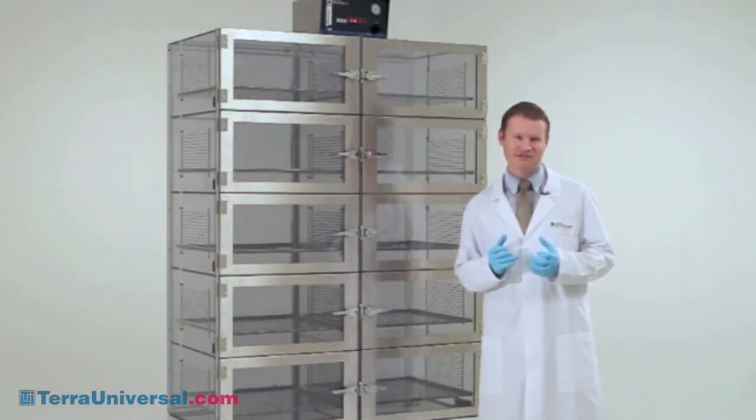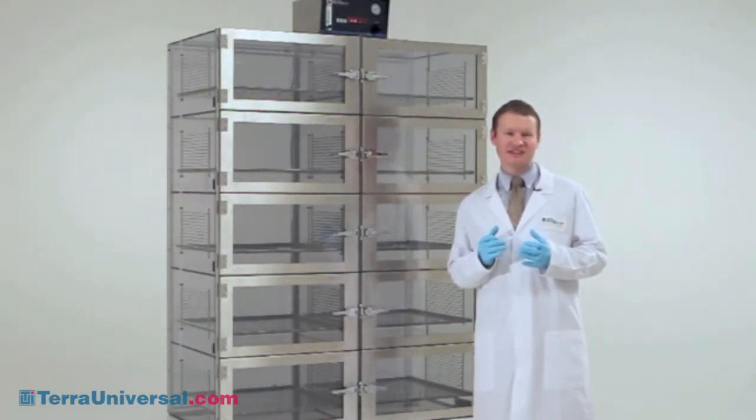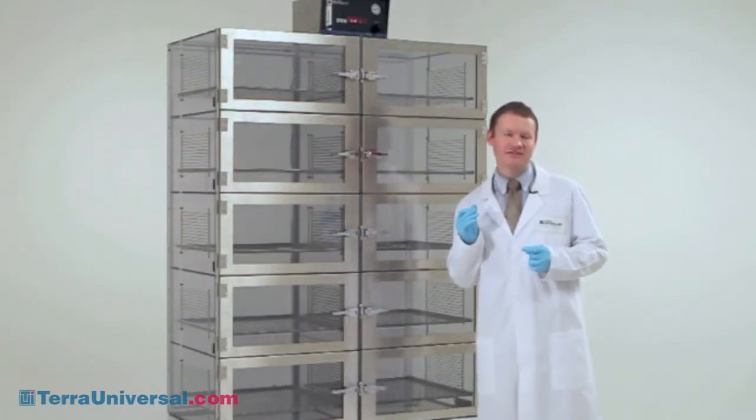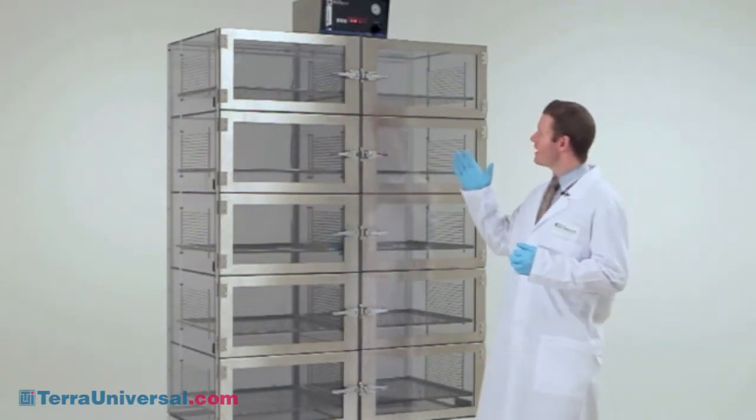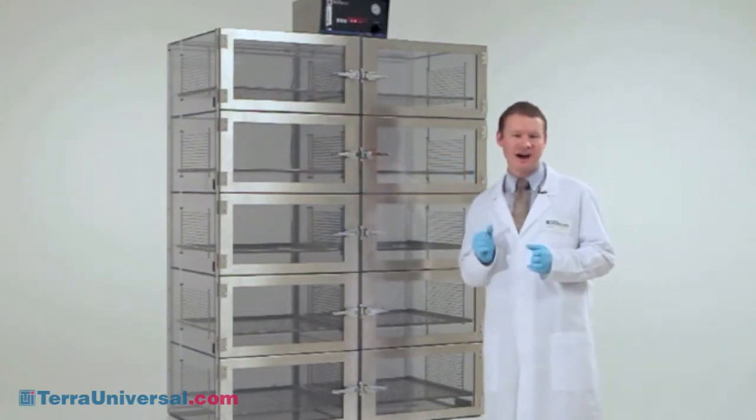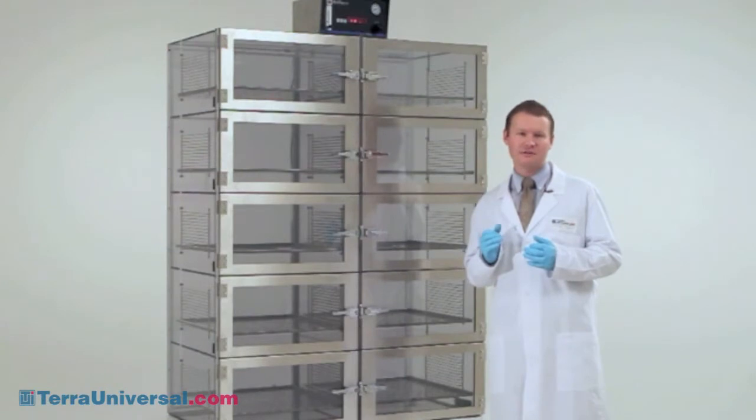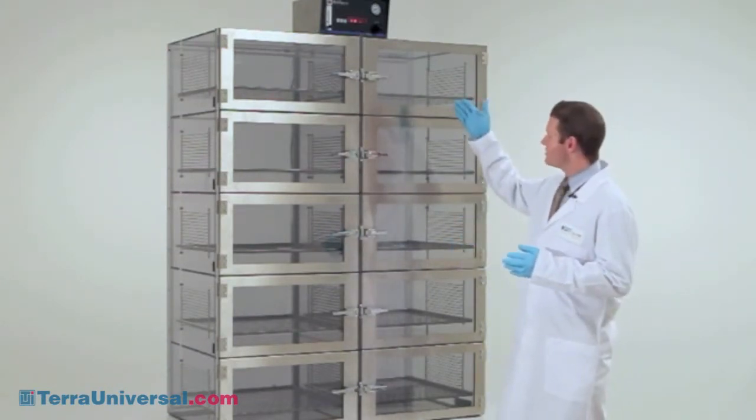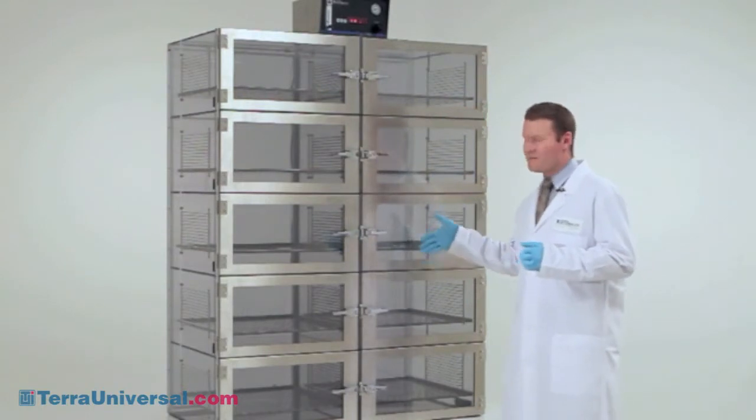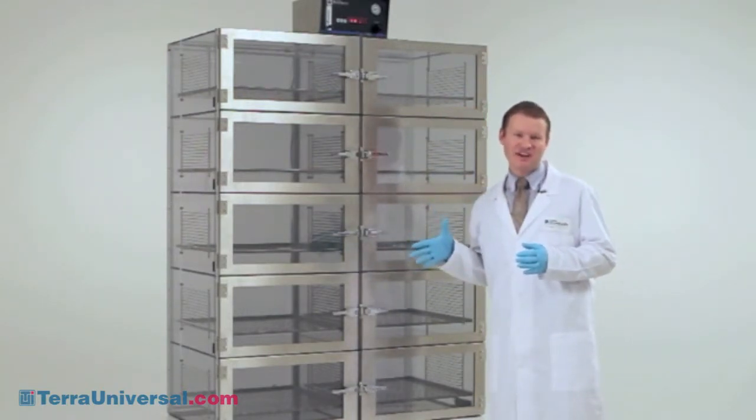Tera Universal's desiccators are designed to facilitate a low humidity environment by the ingress of nitrogen, which is a dry, particle-free compressed gas. That nitrogen is introduced through the back of the chamber, through a back plenum, into each individual chamber.